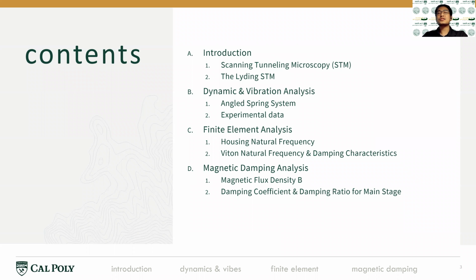For the presentation today, I'd like to break it down into four main topics. The first one is the introduction to scanning tunneling microscopy, or STM, and a specific type of STM called the Lyding STM, named after a professor that invented it.